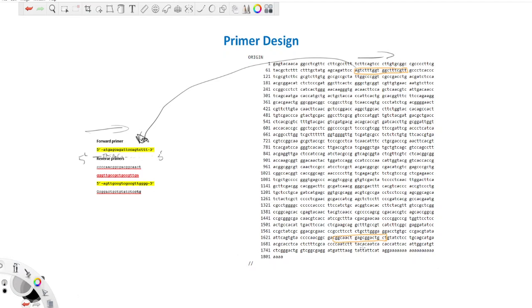For your reverse region, which goes in this direction, this is a little bit tricky. But again, it's not necessarily too difficult, or like the end of the world. You should be able to still get something good out of it.